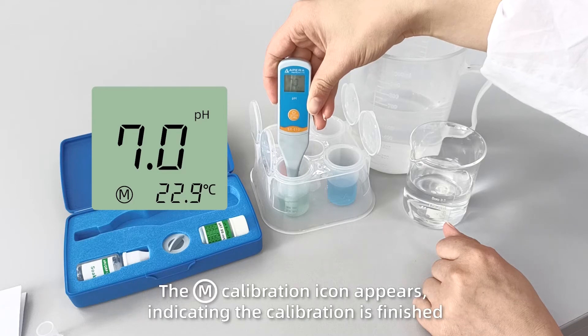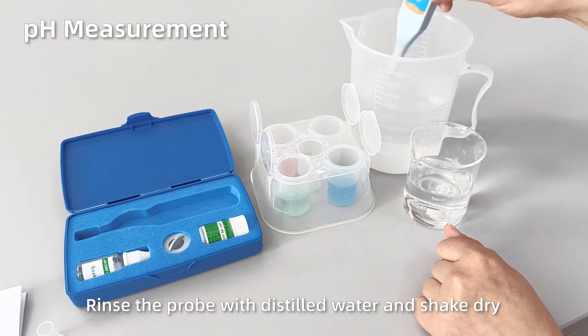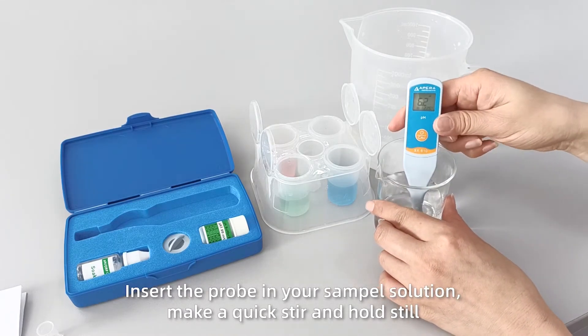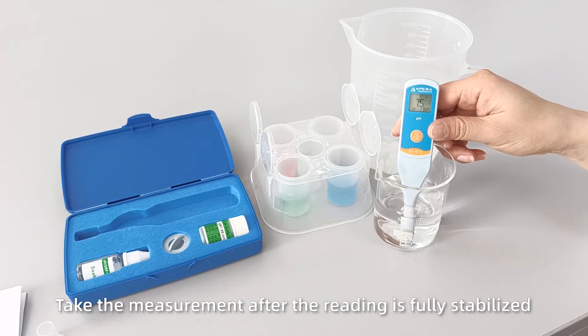The M Calibration icon appears, indicating the calibration is finished. For 8.0 PH measurement, rinse the probe with distilled water and shake dry. Insert the probe in your sample solution, make a quick stir and hold still. Take the measurement after the reading is fully stabilized.